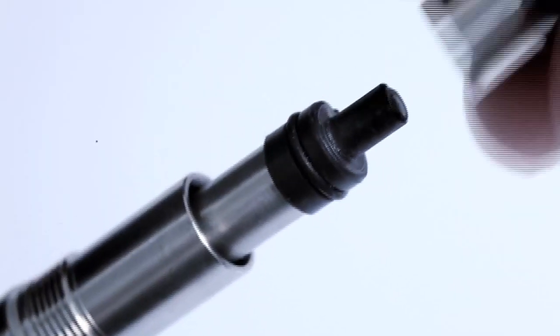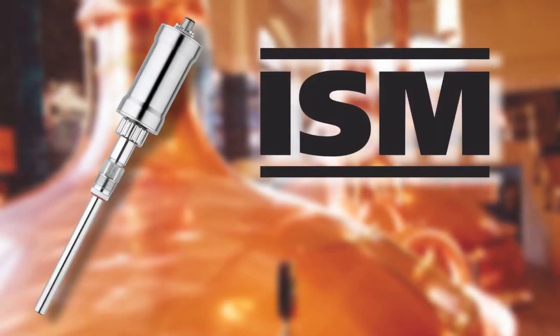The Dynamic Lifetime Indicator uses sophisticated algorithms to calculate the remaining life of the sensor. Breweries therefore have confidence that the sensor won't fail unexpectedly.